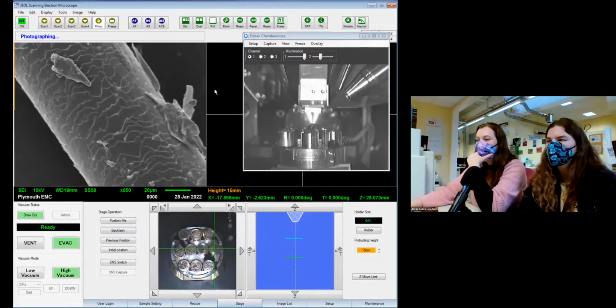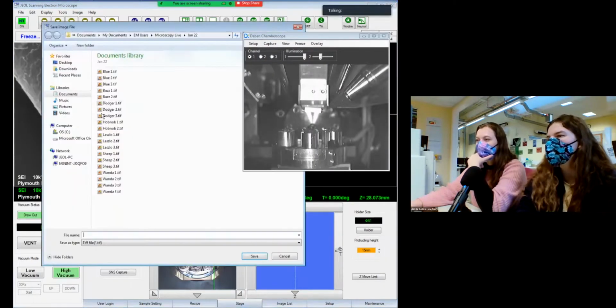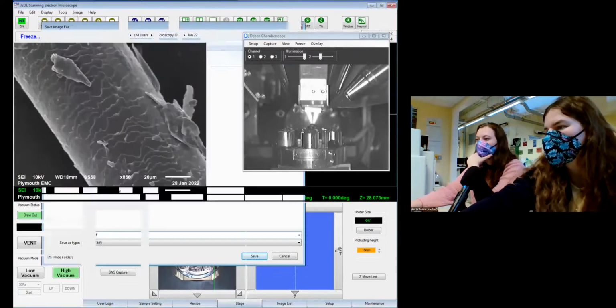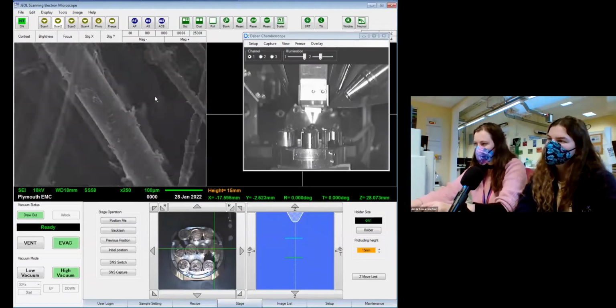It's cool to see how different it actually is. Well, that one's saved, and we'll go to the next dog. This has got a lot of thin plates in comparison to the others too. It's cool. So I wonder if it is just an inner coat, outer coat situation.